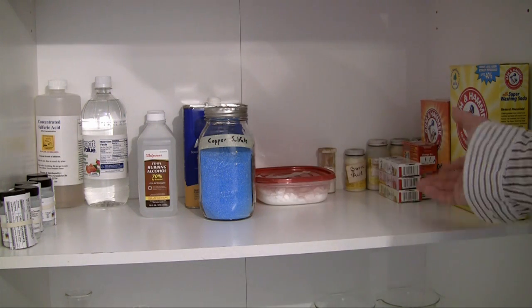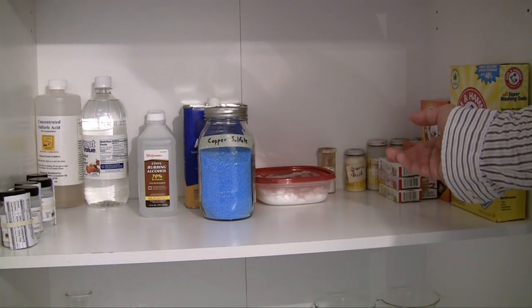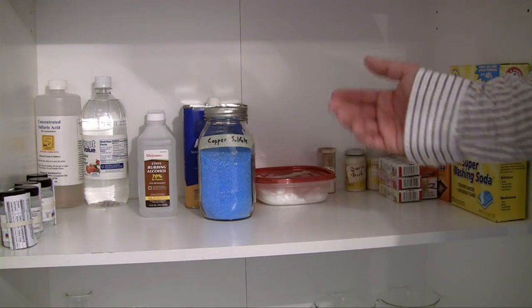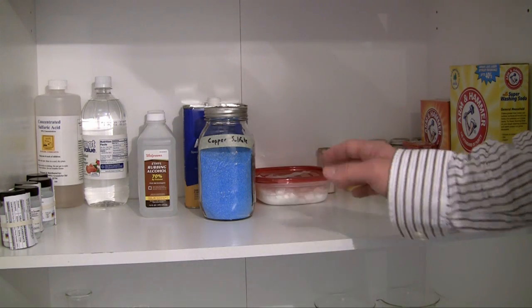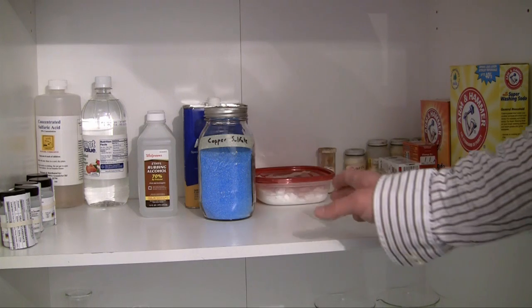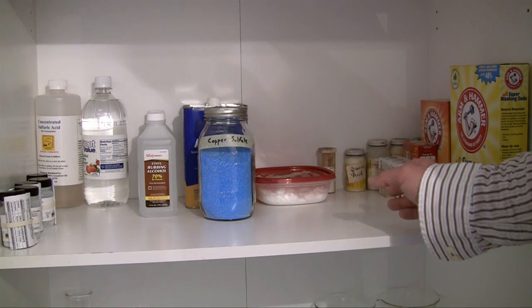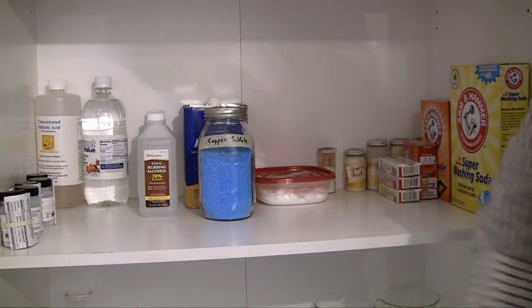So none of these chemicals are right here. Of course you have some reactions like your vinegar and your baking soda or your sulfuric acid can react with potassium chlorate but they really need to be heated up to properly react with each other. So right now I have everything separated in a proper way and all my very reactive stuff I don't even store in here I keep completely separate.